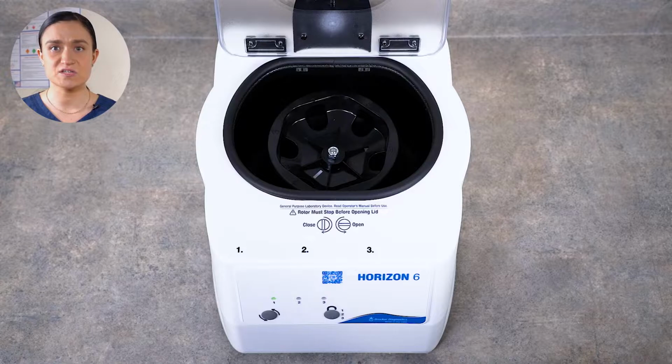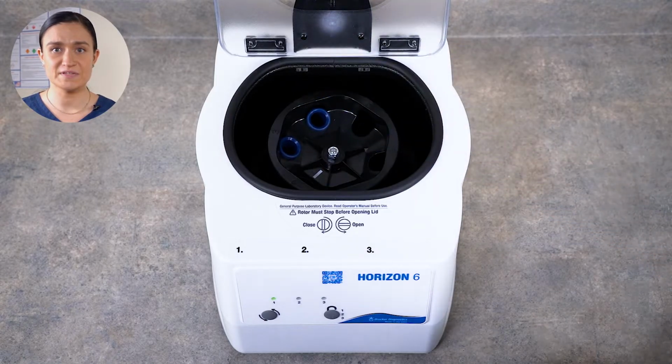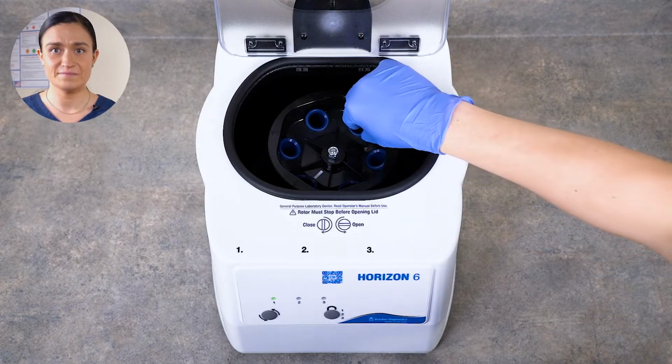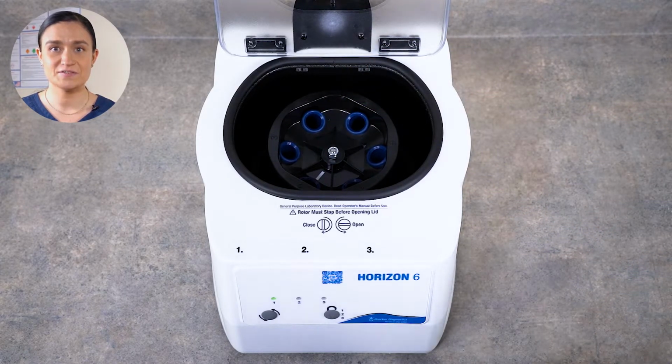You can see the slots all around the rotor. Simply place one blue tube holder in each. When the tube holders are properly seated, you will be able to move them slightly. This is by design, and that's what allows them to rise into their horizontal spin position. They do not click or snap into place.